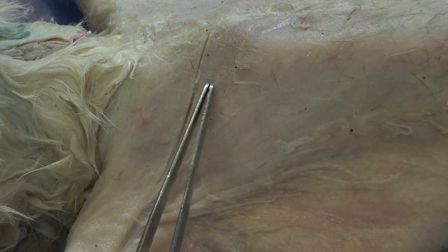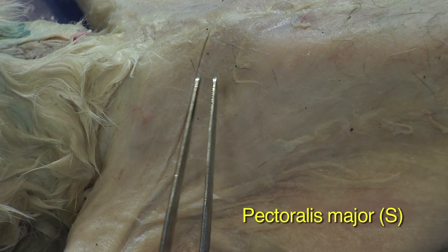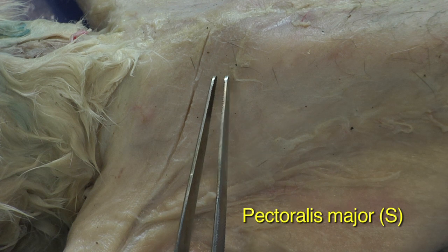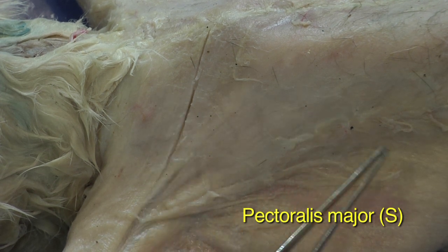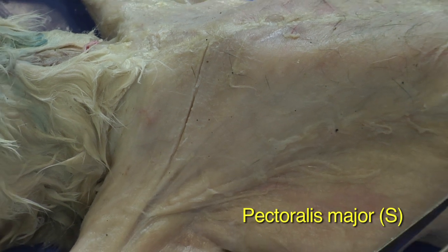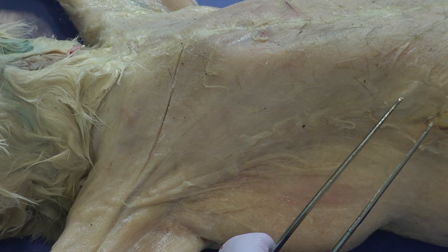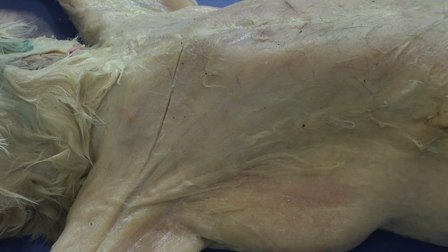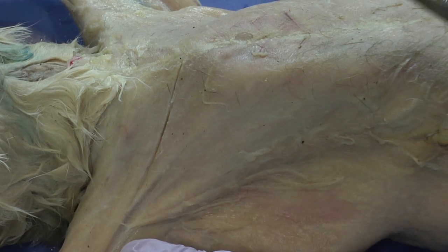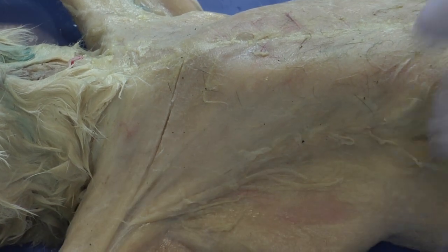That creates a separation between one muscle group and another. If this is the upper boundary for this muscle — this is going to be the pectoralis major, which is one of the muscles we want to identify — then I need to find the lower boundary for that muscle. For this, I'm going to set the scalpel down and take a closer evaluation.